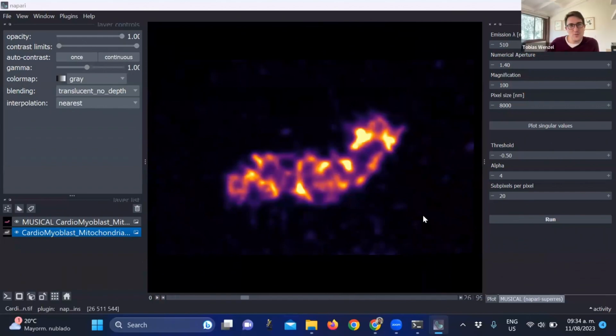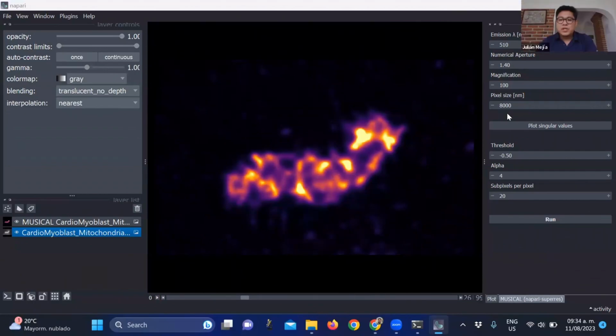Julián, do you have, yeah. Why is this output still a video? The output is not a video.